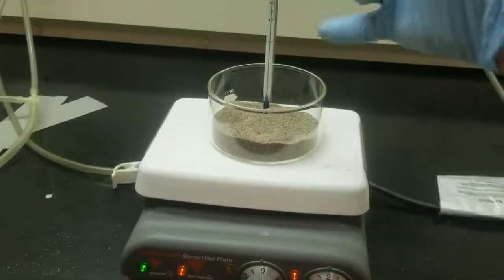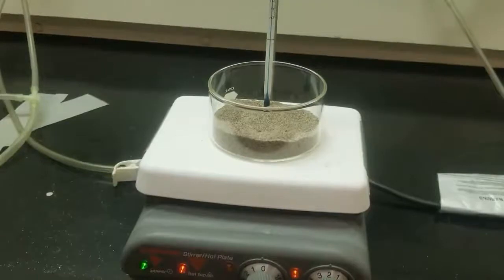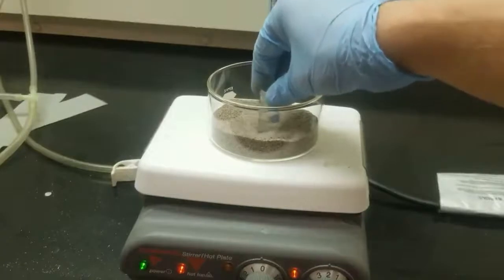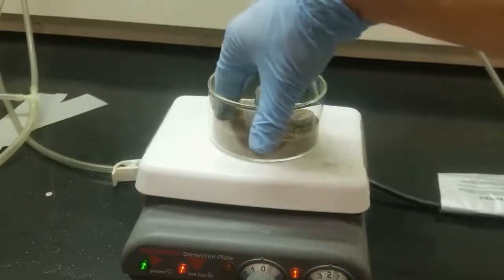All right, so we've got our warm sand bath. It's reading about maybe like 47 degrees Celsius. We'll go ahead and put our pre-tared conical vial into our warm sand bath, dig it in there a little bit, surround it with a little bit of sand.